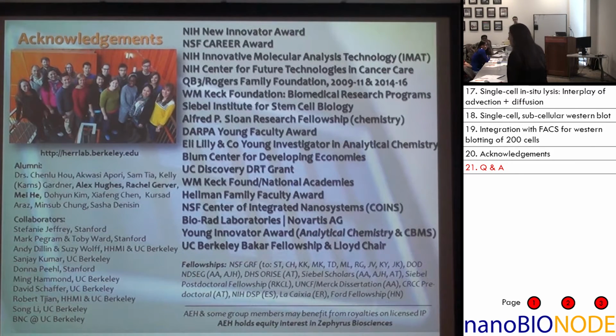Well, it turns out that we don't use hydrophobic interactions. We use this benzophenone moiety that covalently binds to the proteins. That moiety is only reactive when UV light is shined on it. I think the timescales for the kinetics of that reaction are sub-microsecond. So as soon as I turn off the UV light, that polyacrylamide gel is inert. It's inherently blocked, so the only reactive sites are where the proteins are. That's one reason that we, as separation scientists, often use polyacrylamide gel, because it has very little non-specific adsorption. We turn on and off the activity of the gel with the light.